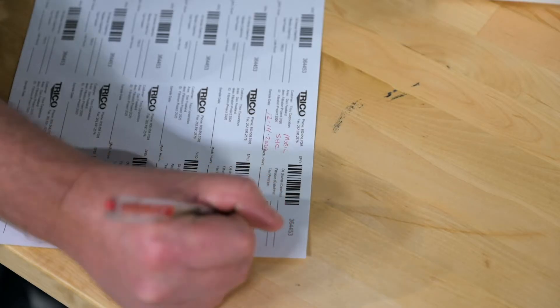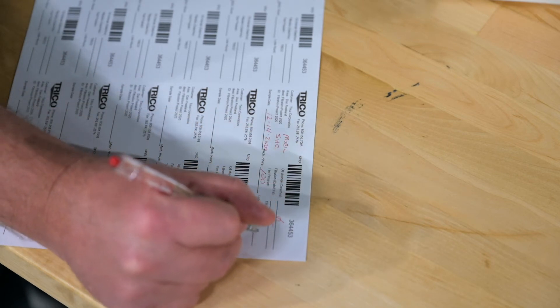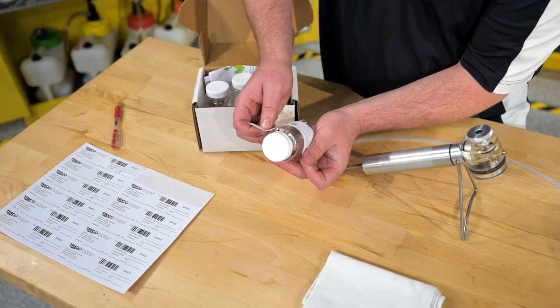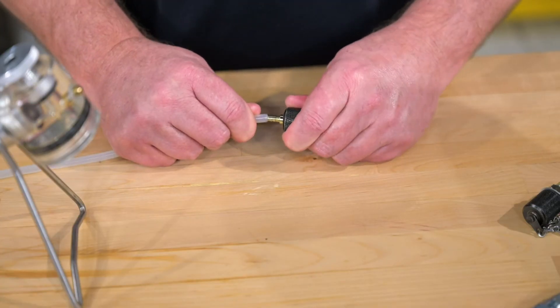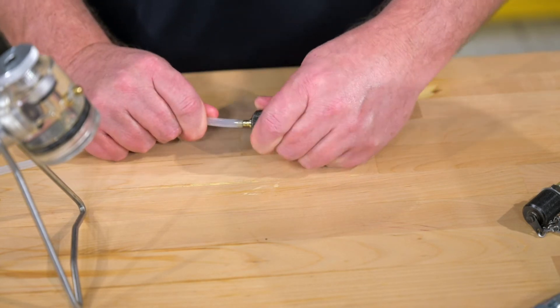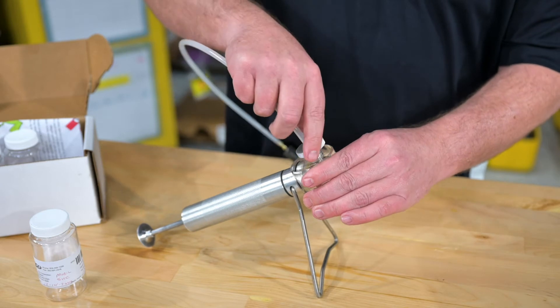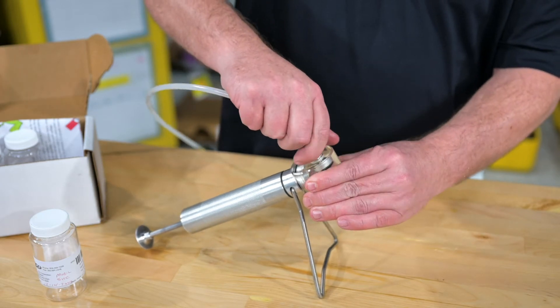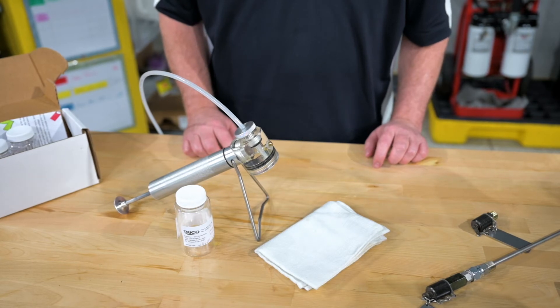We'll start by properly filling out the information on our label to match the equipment and the oil we are sampling, then cleanly apply it to one of the sample bottles. Next we connect the sample port adapter to our disposable tubing, and connect the other end of the tubing to our vacuum pump and tighten down the fitting. These are now ready to go out in the field and take our sample.